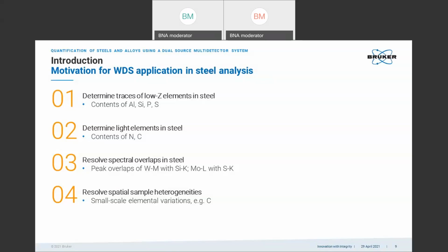And fourth argument is we have a very high spatial resolution, like other E-beam technology, so EDS as well. So it's on the same scale, and that is better, so higher resolution in terms of space than X-ray based technologies. So we can see heterogeneities if there are.